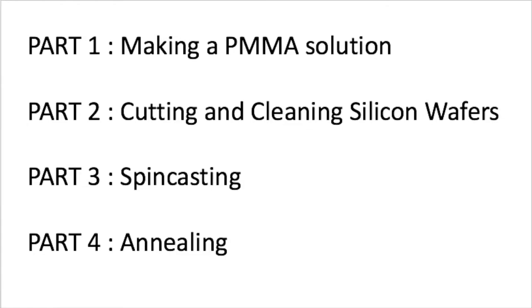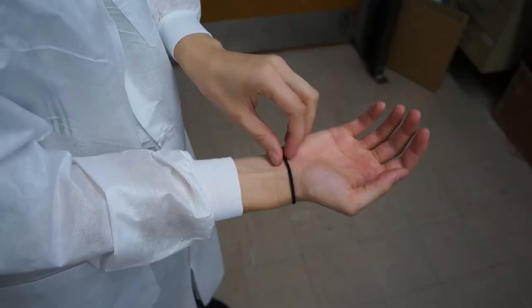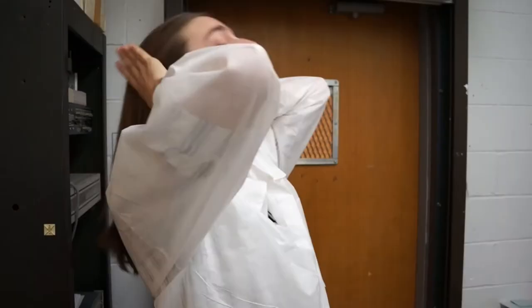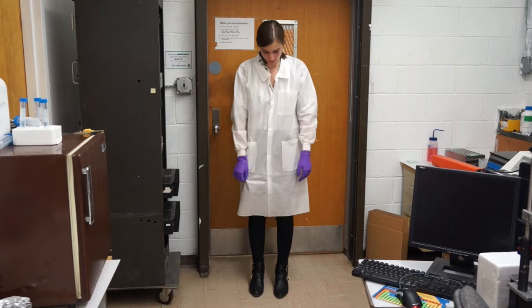But first let's talk about personal protective equipment. For lab safety, you will need the following. First, if you have long hair, you should tie it back with a hair tie. Of course, you'll need gloves, and lastly, a lab coat, making sure that you are wearing long pants and closed shoes.